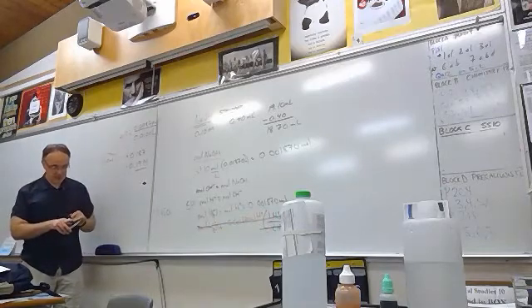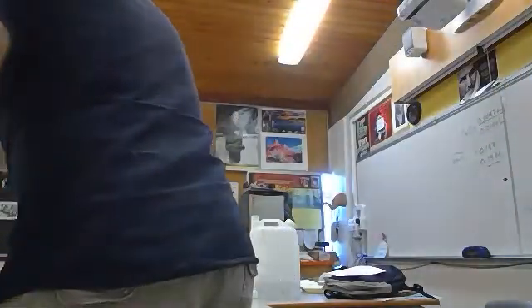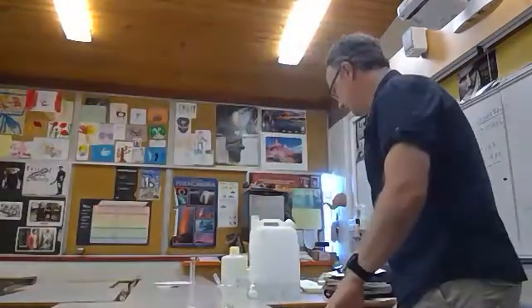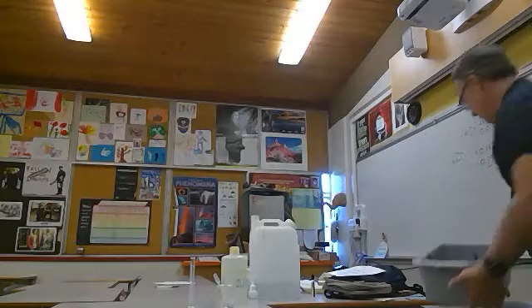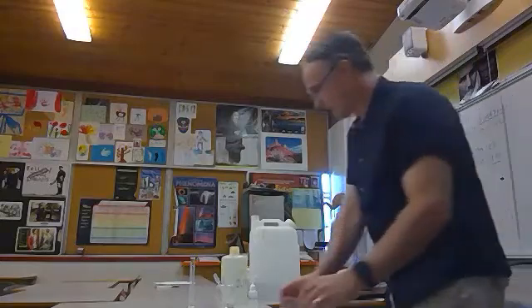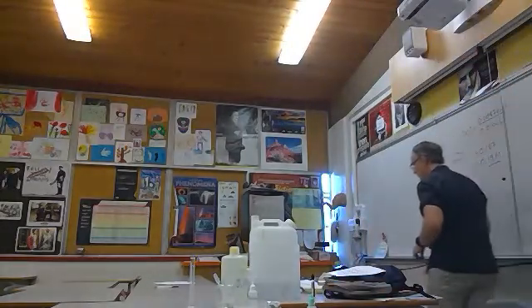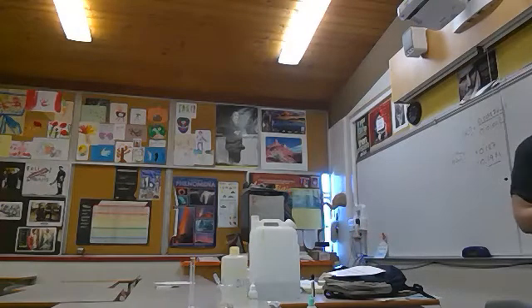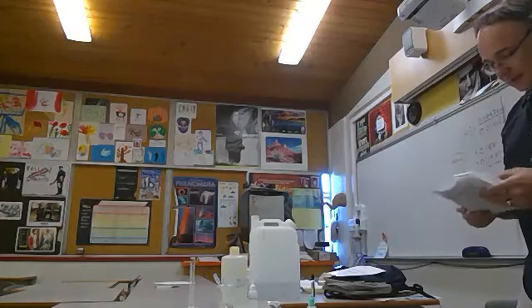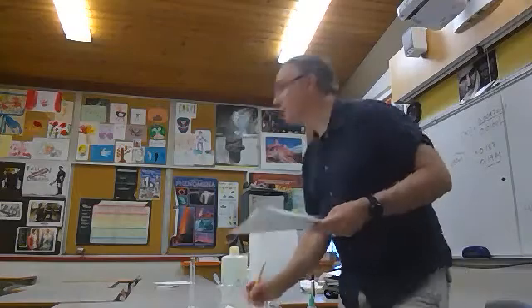Okay. The other thing I was going to talk about was indicators and buffers at the same time. I'm just going to move my apparatus out of the way. One of the chemicals that's used for indicators is bromothymol blue. I'm not sure if that's on our data sheet. Bromothymol blue has a pH color change from 6 to 7.6. So it's fairly close to neutral conditions.